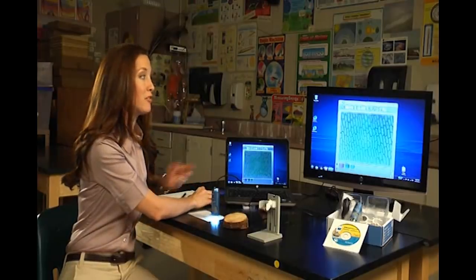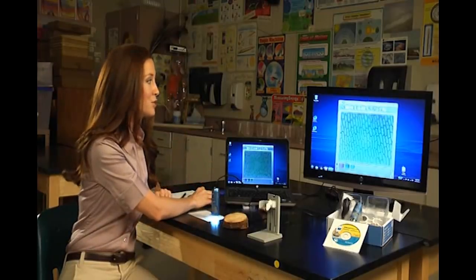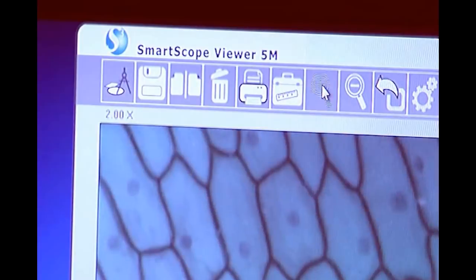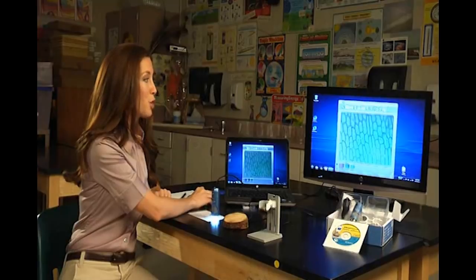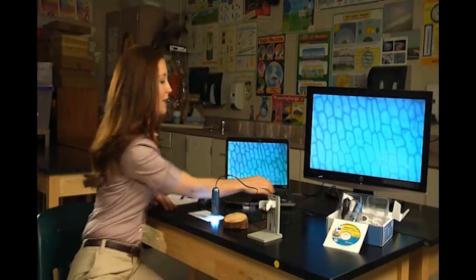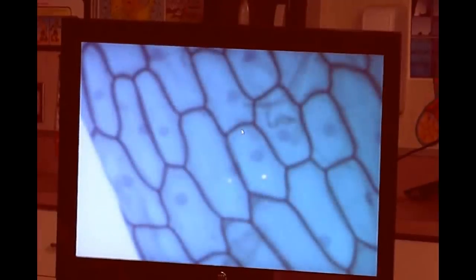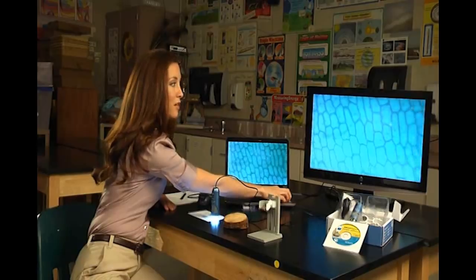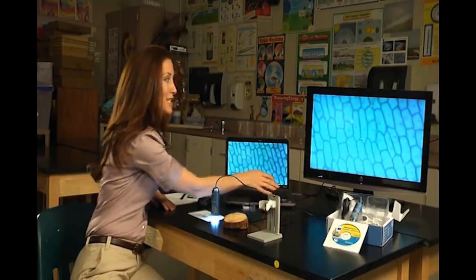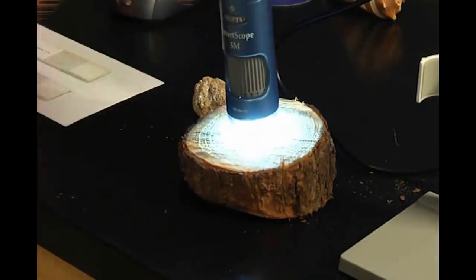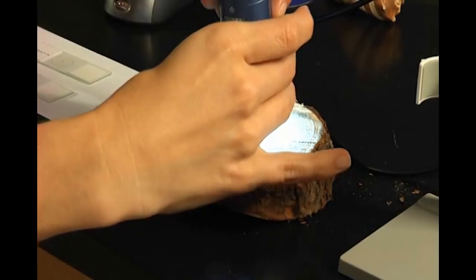It's really easy to zoom in further by clicking on the zoom in icon at the top. So you can zoom in. You can go back into full screen mode. And you can even use the arrow keys to move around the picture. So you've got a lot that you can really zoom in and see here with the SmartScope 5M. You can analyze things with the SmartScope 5M that you would never be able to look at with a regular microscope.